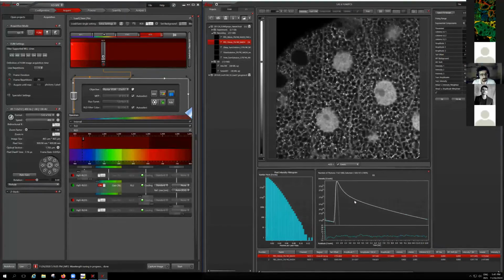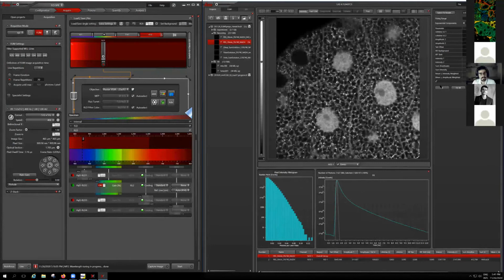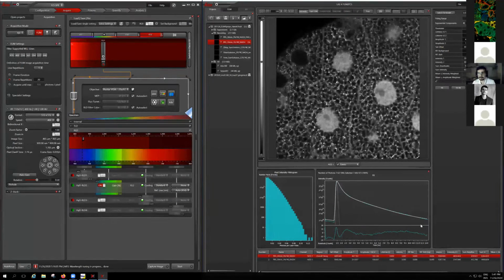The second one is that you look at the residual, if there is any evidence of deviation in the residual. Here, if I start again from 0.2, the residual is changing from -15 to 15 counts. If I zoom in here, it seems like there is a systematic pattern.